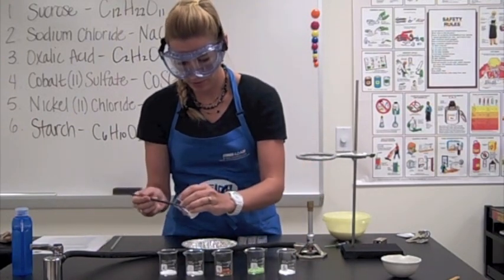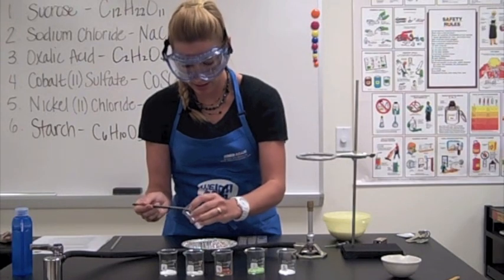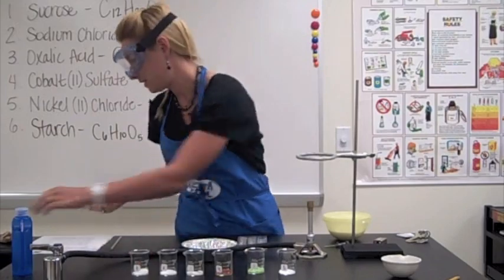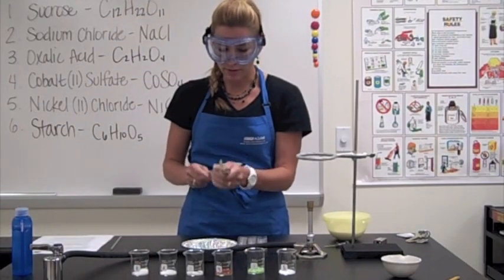So just take a little bit of the first compound. And I'm talking tiny, tiny amount, we don't need a lot on here. All we're looking for is to see if it's going to melt.